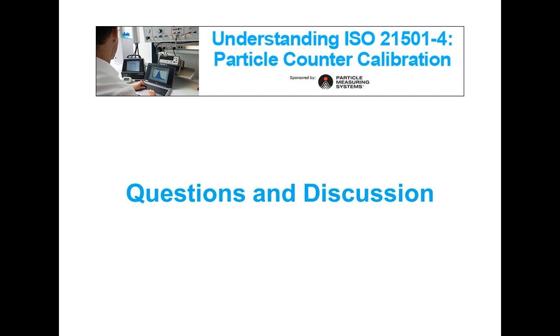As I probably explained before, the calibration of a particle counter is not something really easy. It includes a lot of different tests. It requires the use of sophisticated systems, and so I would say refer to an authorized center, and most of the time to your manufacturer calibration service lab for calibrating your particle counter.